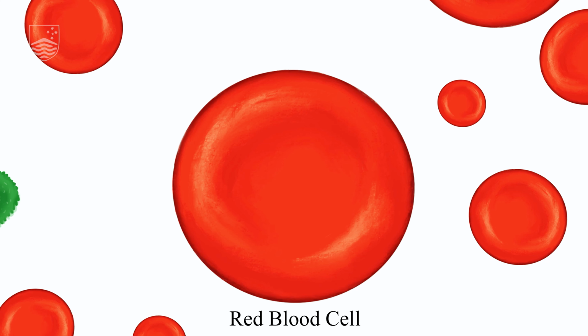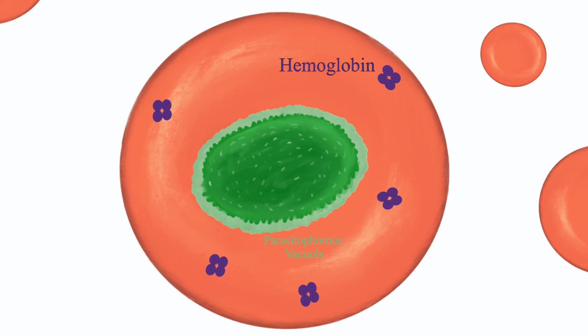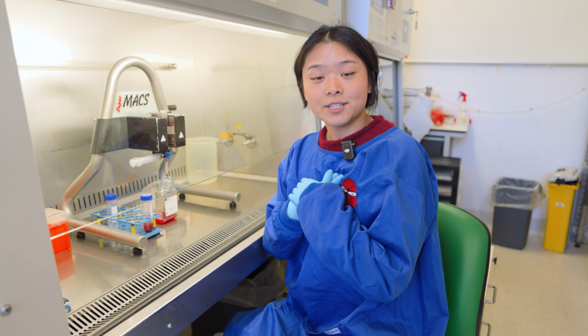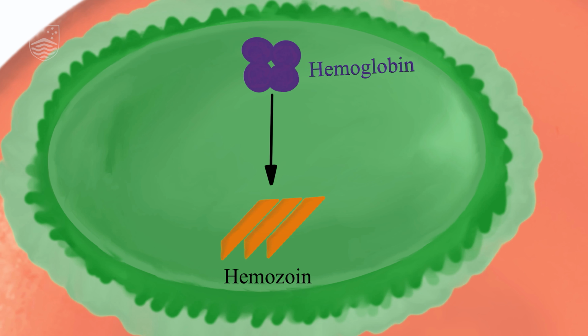So the malaria parasite lives within the human red blood cells. Inside the cell, it eats up something called hemoglobin. The hemoglobin, as you may know, transports oxygen within your blood. And after it does that, the parasite poops out a weird byproduct called hemozoin crystals. Think of it as malaria poop. And there's something fun about it, it's actually magnetic.